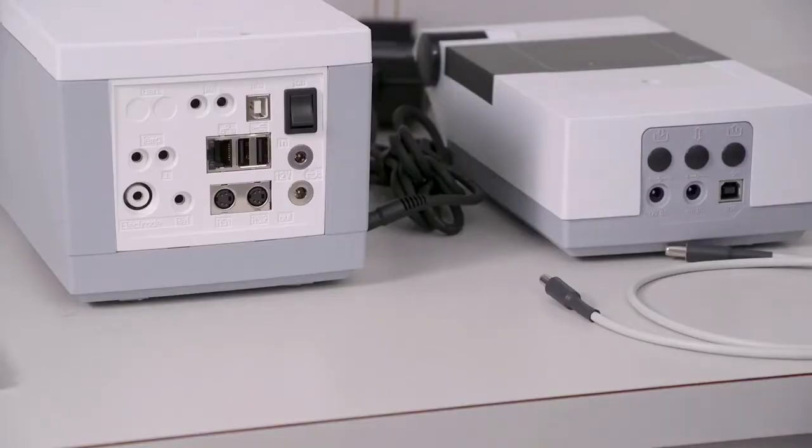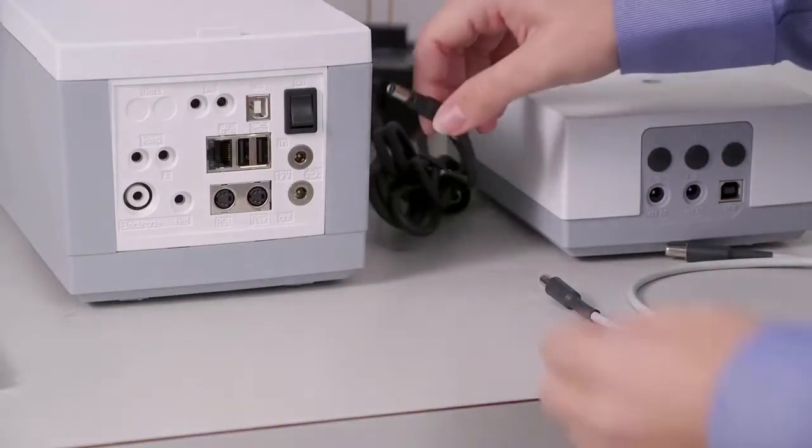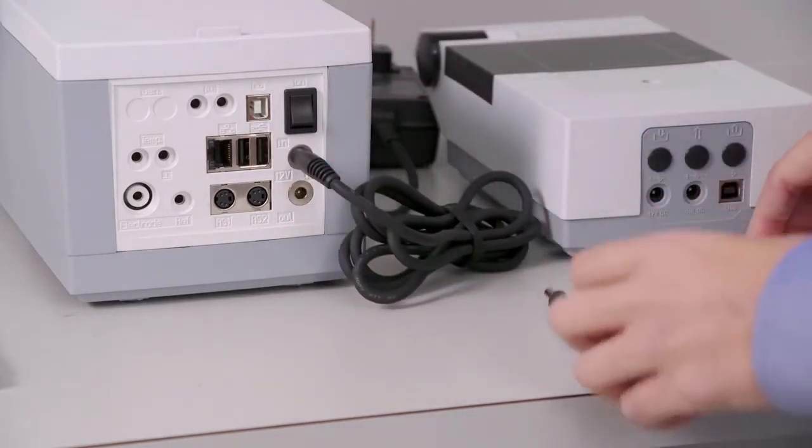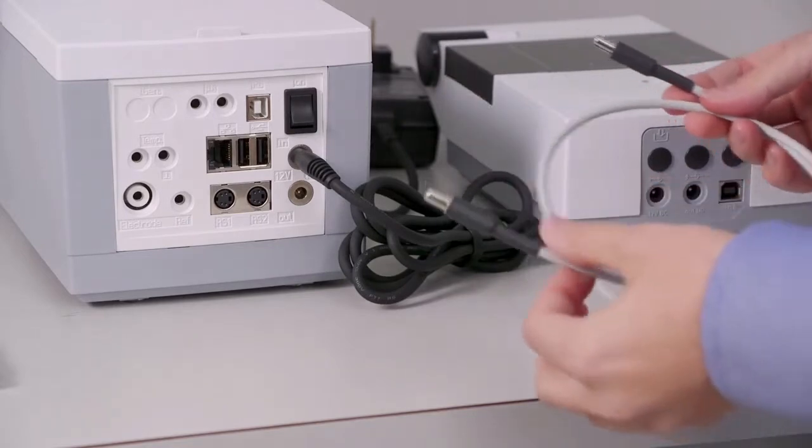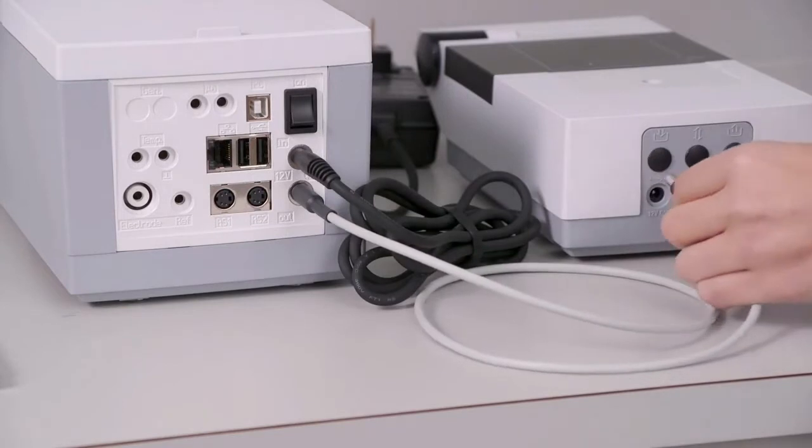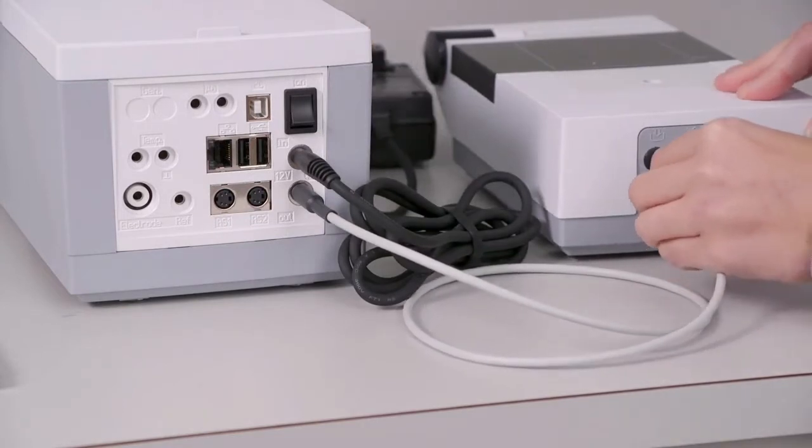We're going to take a look at the back panel of the titrator. The main power supply will get plugged into the in 12 volt port as so. The magnetic stirrer cable will get connected by one end into the out port here, and the other end into the in port of the magnetic stirrer.